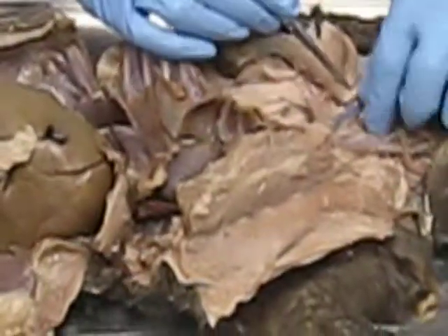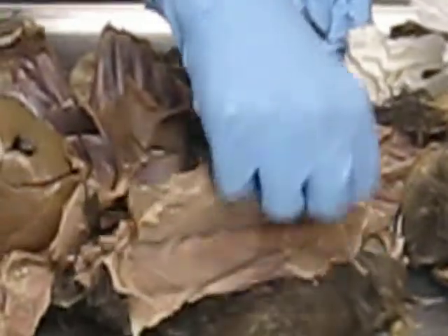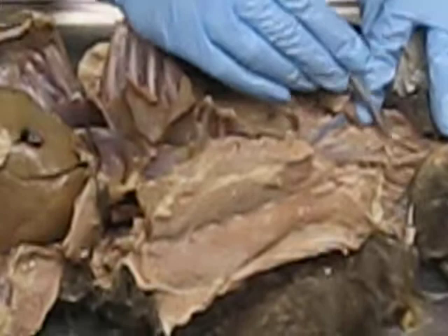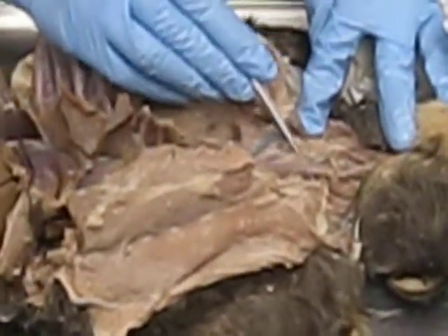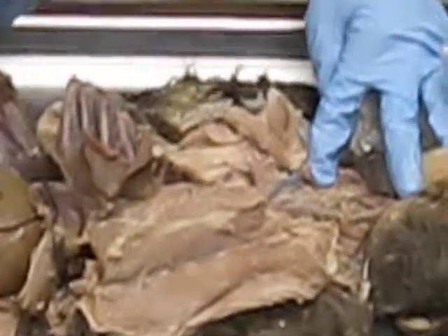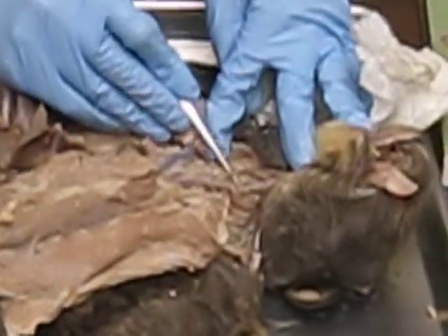Then you have your external jugular vein, which is this big one right here. There's an internal jugular vein. I'm not sure if you're going to see it. Again, left and right. It's really, really tiny. I think it's right here, and it's been kind of snapped. Do you need to know that one? You do need to know it, and in some cats, hopefully there will be some that are visible, but it's tiny, tiny, tiny.